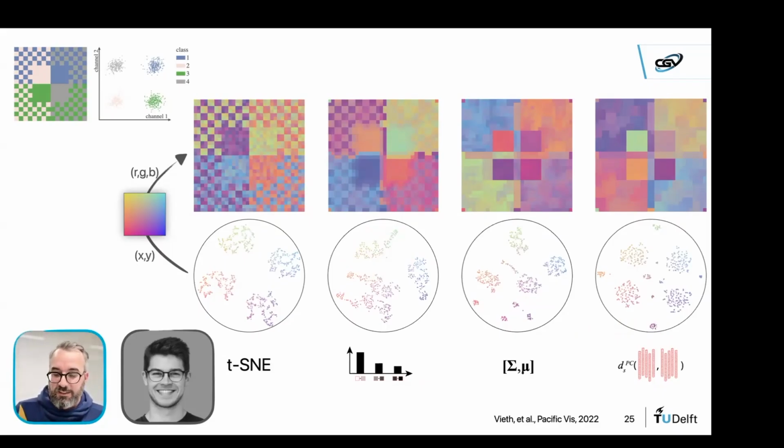And they actually do exactly what we expect, right? So we have basically these four major clusters still that correspond probably to the inner parts. I'm not 100% sure right now. But then we also have smaller clusters that are sort of the other regions in the image. And then the remapping really shows we have our outer parts here with the checkerboards, and we have the inner parts with the homogeneous values.